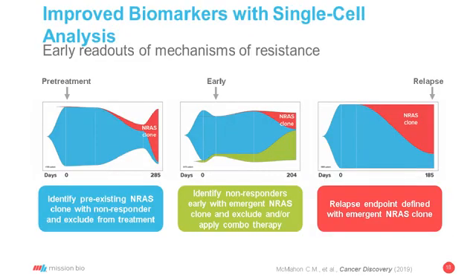Now, this paper has just recently been published in Cancer Discovery, where they looked at multiple different patients across the serial time points. And you can see in some cases, in case 1, a subclone that ultimately relapsed was actually detectable pre-treatment at a very low number of cells. So the resolution that we can gain by looking at 1 in 1,000 cells allows us to look at these cells very early on and say, hey, this is something that existed pre-treatment, ultimately leading to relapse.